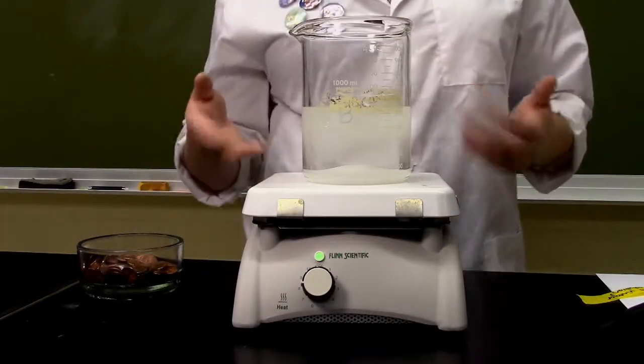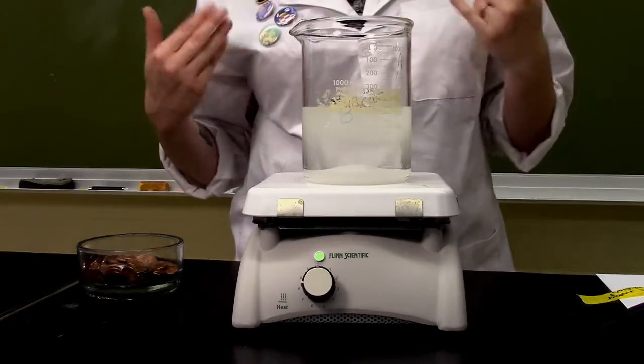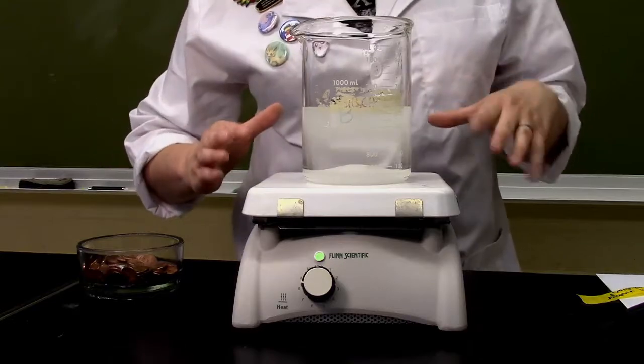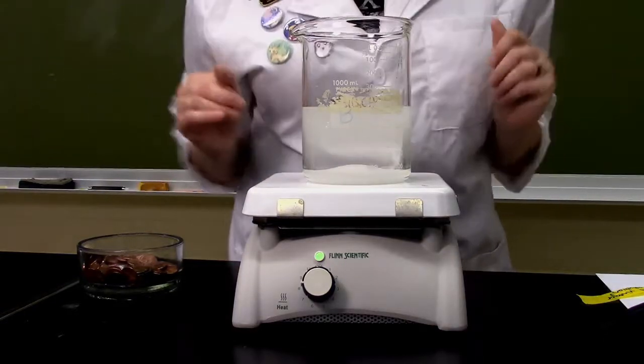Y'all, these hot plates are basically just like campfire stoves. They are literally hot plates. So be careful if you use one that you never touch the actual top because it can burn your fingers.